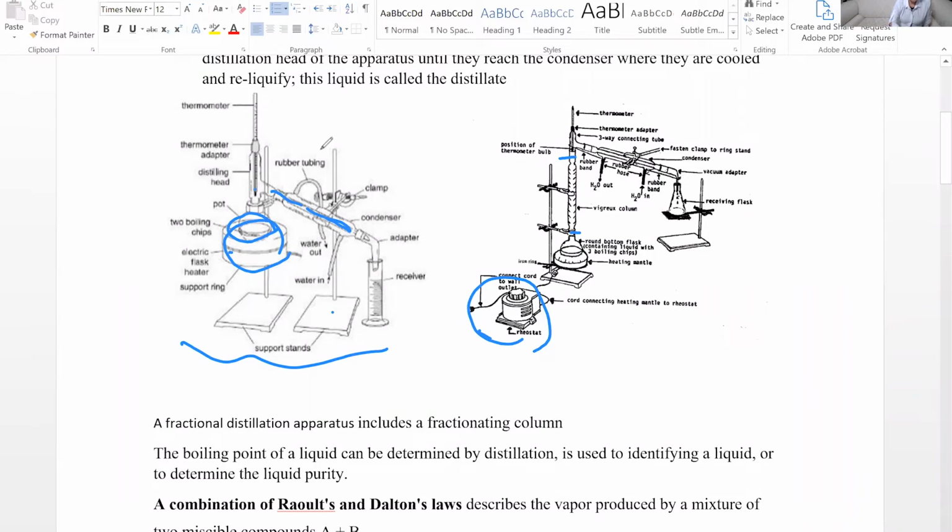If you notice here, if you have a mixture of A and B going to the vapor phase in simple distillation, both of them make it to the condenser, and you get a mixture of A and B in the receiving flask, because there's nothing to hold it back, unless one has such a high boiling point that it will never boil, or it's a solid compound, or an inorganic salt with a very high boiling point.